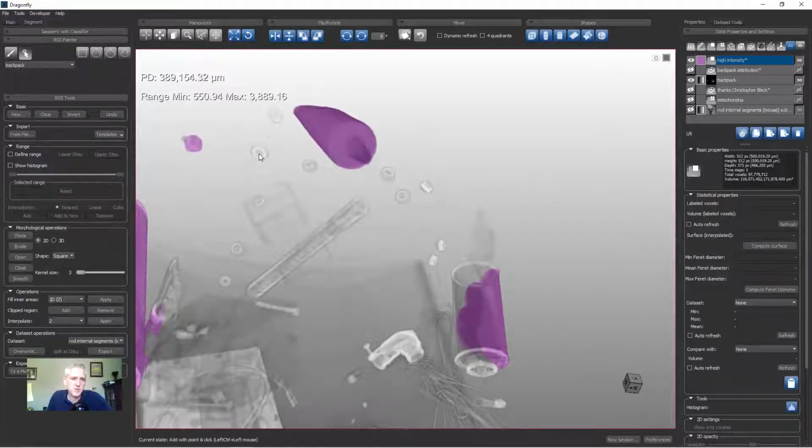If I want to add each of these little bolts, okay, it's a little noisy because there's lots of these pixels that are not quite as transparent. If I remove those, here, you remove them. Maybe I want to change the brightness and contrast a little bit so I get a cleaner segmentation. Now when I do the point and click, still pretty messy. There is something we hadn't looked at yet. We'll look at tomorrow morphological operators that could help clean that up, like with a 3D opening we might run. It's going to run on all the data, not just on those, so it might actually be a little bit slow, but you could do a 3D opening and see if it cleaned up some of that.